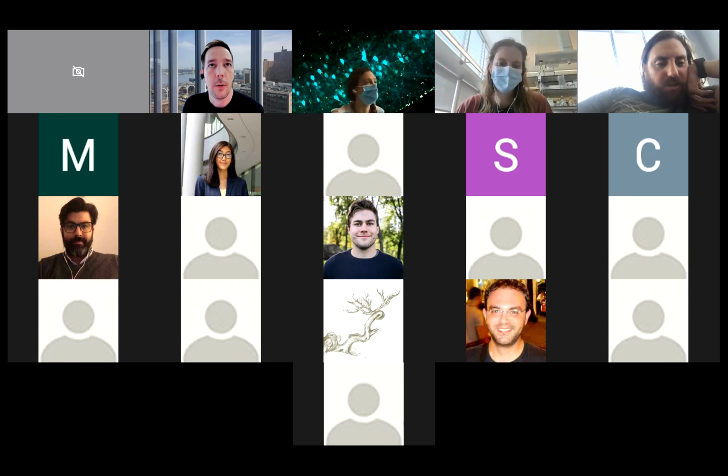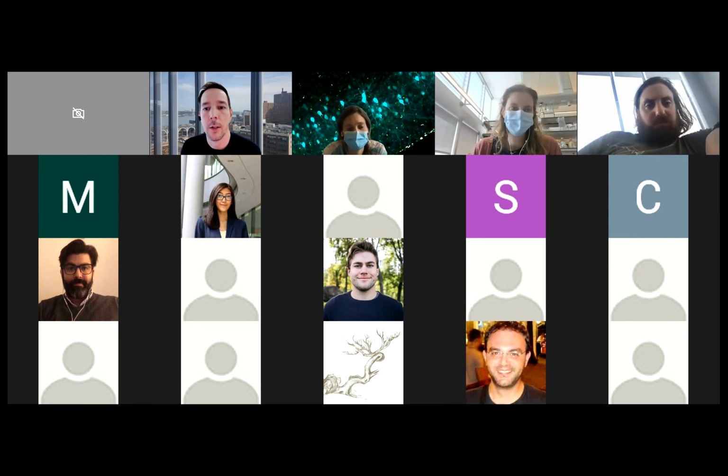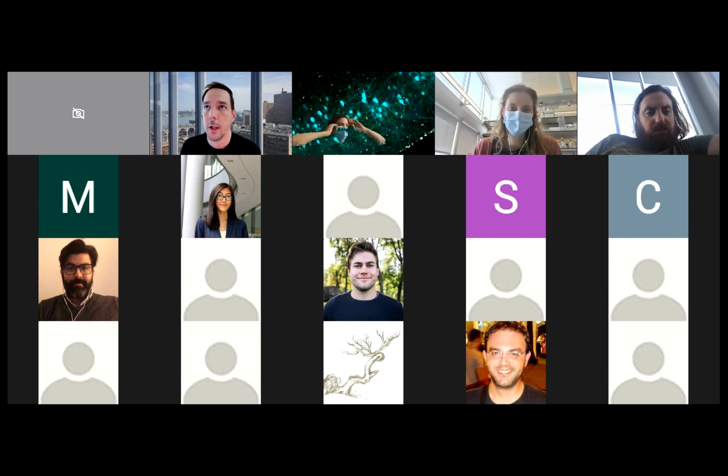No, if it's a hemi section, then the way to deal with it would be to go into the Atlas folder and actually just remove the hemisphere. It might take a little bit of troubleshooting. If you're having trouble with that and it doesn't work immediately, let me know and maybe we can figure something out. But as long as you've got the hemisphere sections and they're in good condition, and you modify the Atlas in that way, you should be okay. I see.